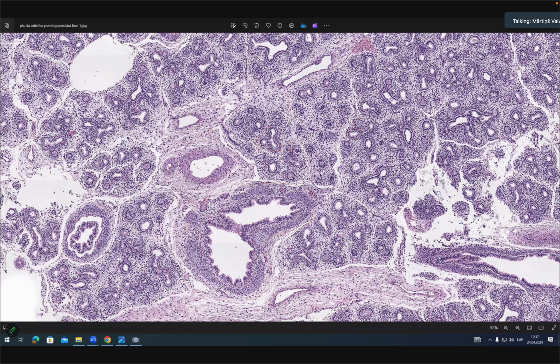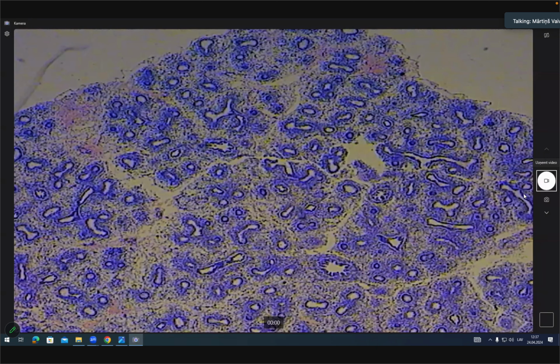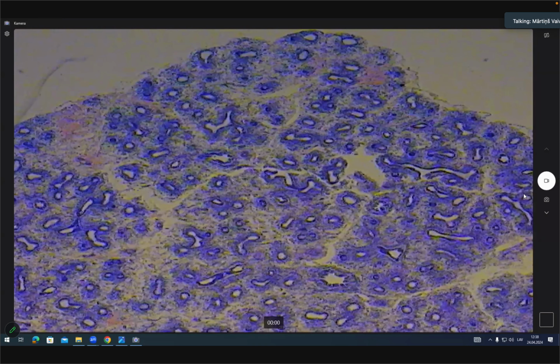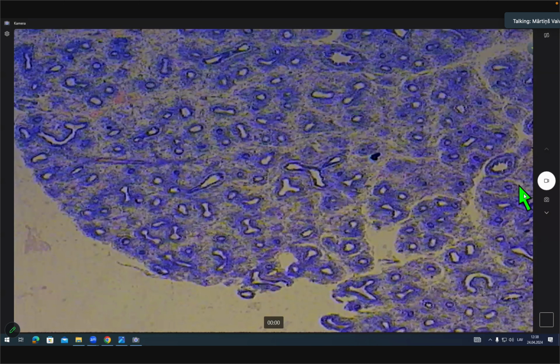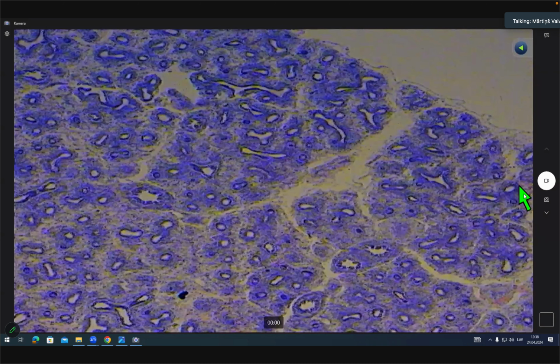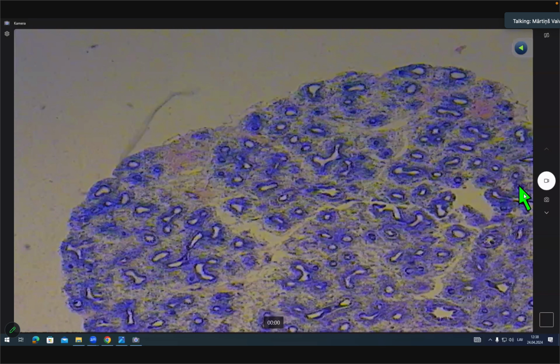I will show you the microscope. So I'll switch to the microscope. I will use the green arrow in the microscope to show the structures. So in the microscope, it looks something like this. So this is a slide also showing lungs in pseudoglandular stage. If I zoom in some of the regions, let's take randomly, any of these regions. Let's zoom in here randomly.